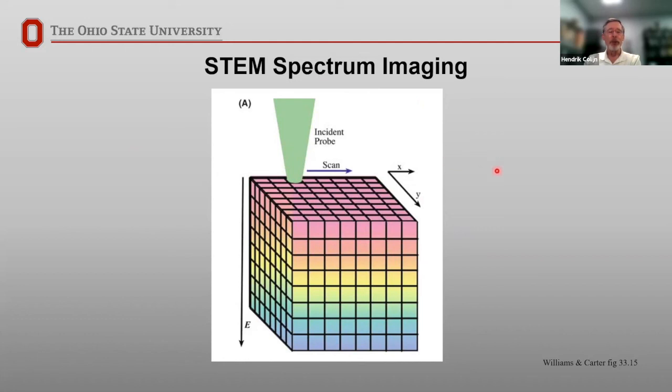And we produce something known as a data cube, where we have our XY coordinates, we'll have our intensity as one of these layers, and then we can have our energy in this direction and have a full spectrum associated with each pixel.